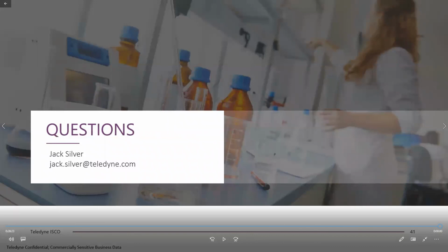Yes, you will get broader peaks in isocratic prep runs, but it's kind of a trade-off between how wide the peaks are and the resolution. So I see where you're coming from. However, on the scouting runs, if you can resolve the peaks on the scouting run, we can resolve them on the focused gradient.